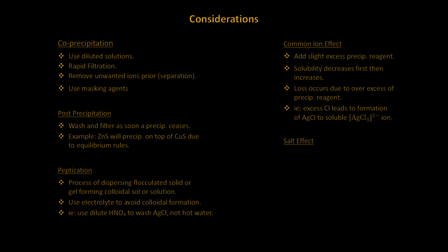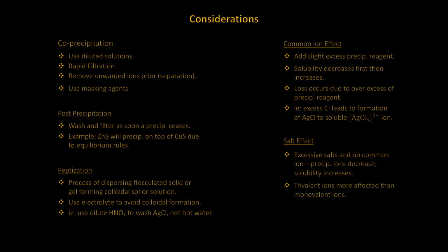Now, the salt effect is another consideration. Excessive salts without a common ion present will decrease the number of ions that may precipitate. In other words, solubility increases and there will be less to no precipitate formation. This affects trivalent ions more than it does monovalent species.